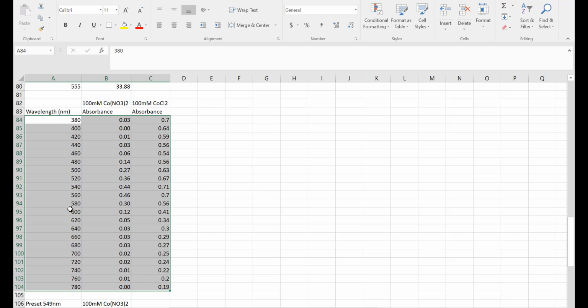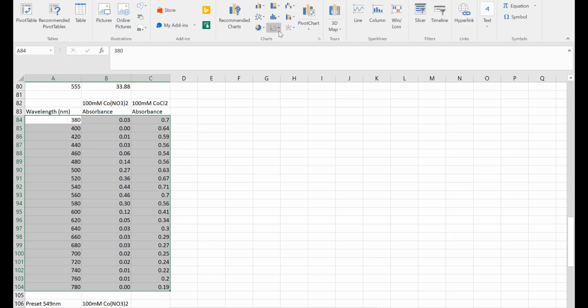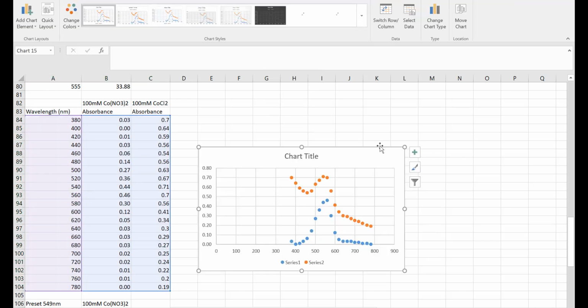Excel will understand that this is your X value, your independent variable, and it's going to plot two sets of values: all these Y values as one series, all these Y values as another series. So again, under your insert tab, we'll plot them as a scatter plot. You can change the titles and all that, and you actually realize that our first solution was this blue style graph.